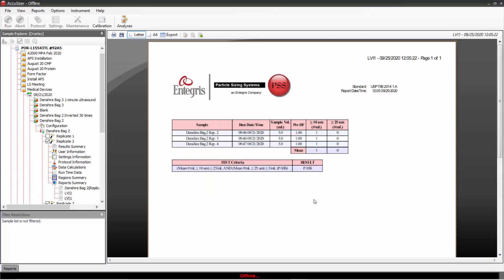It will then generate the report here based on runs two, three, and four, showing us the results for each measurement and the final pass-fail criteria based on these results.